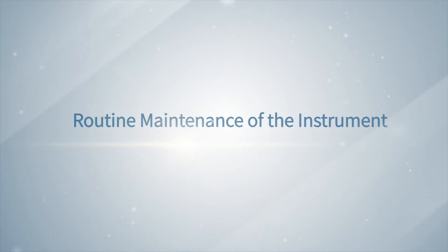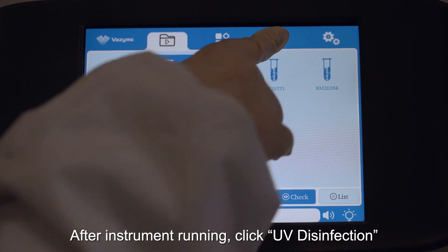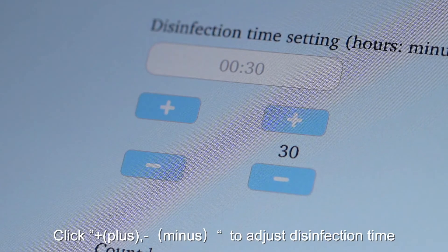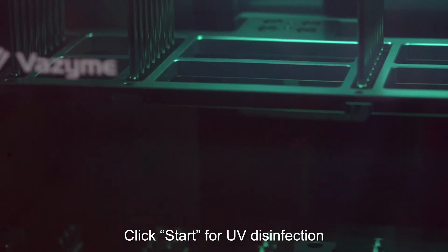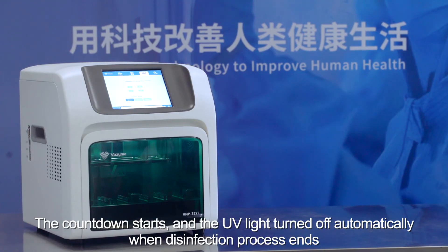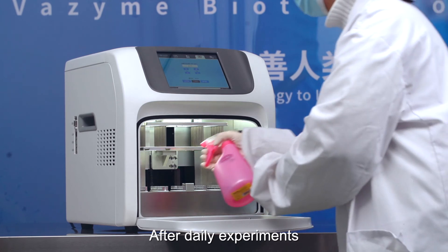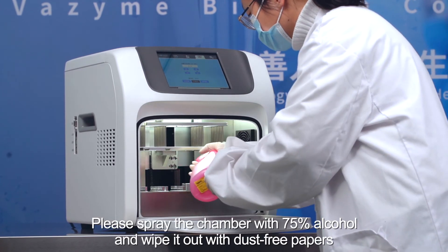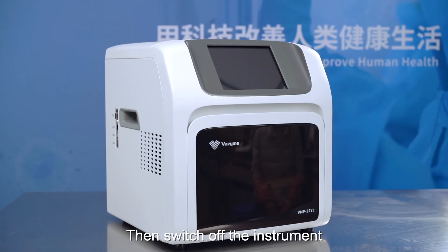Routine maintenance of the instrument: after the instrument run, click UV disinfection. Click plus or minus to adjust the disinfection time, then click start for UV disinfection. The countdown starts and the UV light turns off automatically when the disinfection process ends. After daily experiments, spray the chamber with 75% alcohol and wipe it out with dust-free papers, then switch off the instrument.